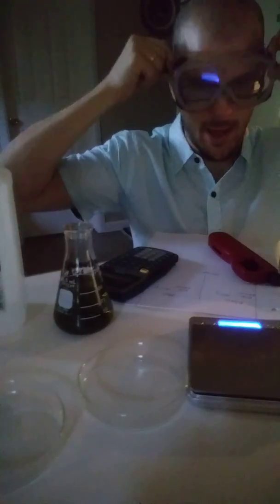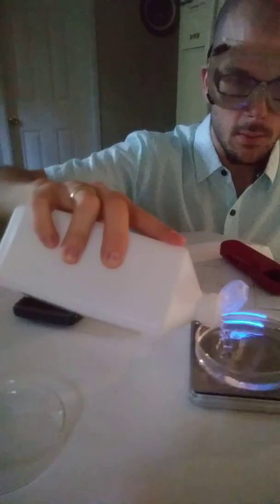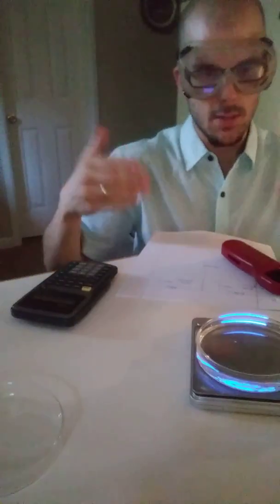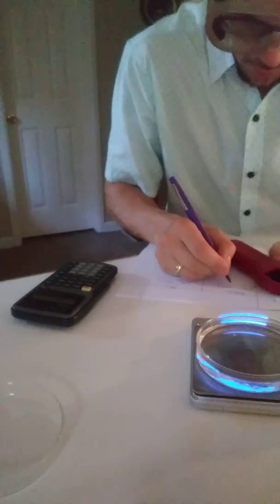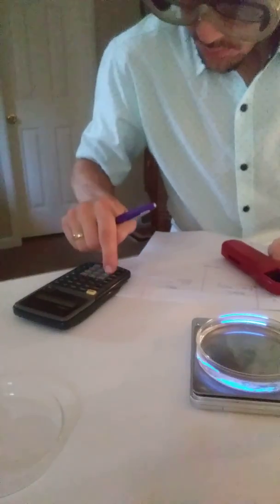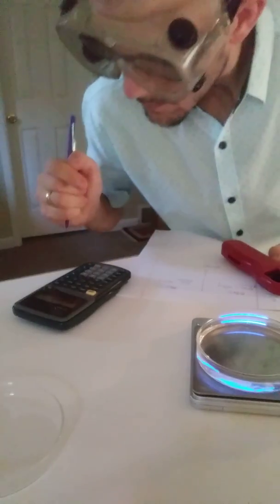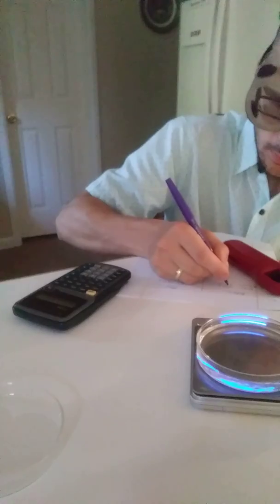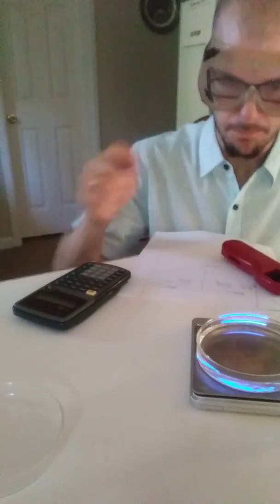Because we are actually burning ethanol, I'm going to make sure I have my goggles on and I've moved anything flammable out of the way. We're going to weigh some ethanol — our dish comes out at 40.21 grams. We pour about half a dish of roughly 90% alcohol, and we end up with 79.18 grams total, giving us 38.97 grams of ethanol.